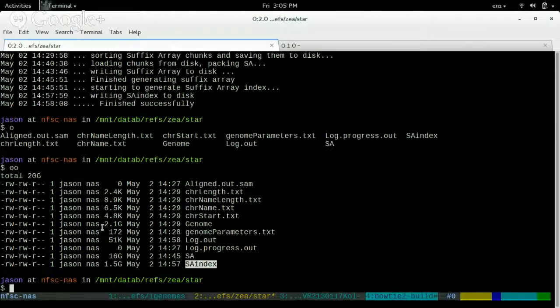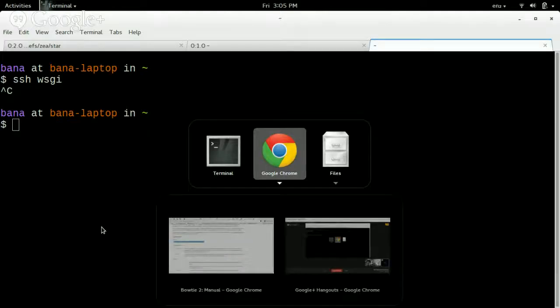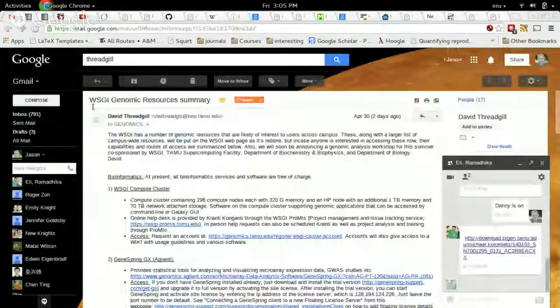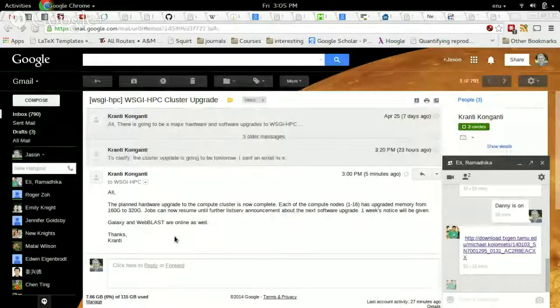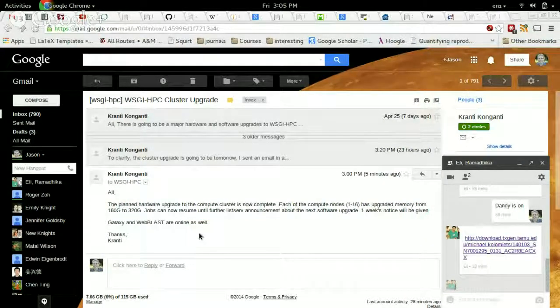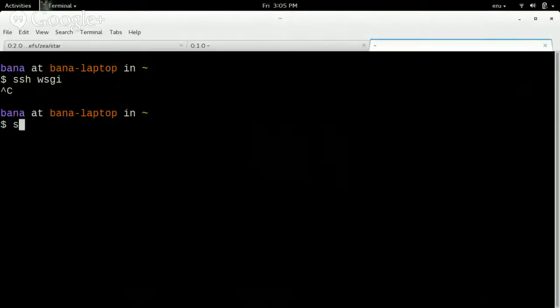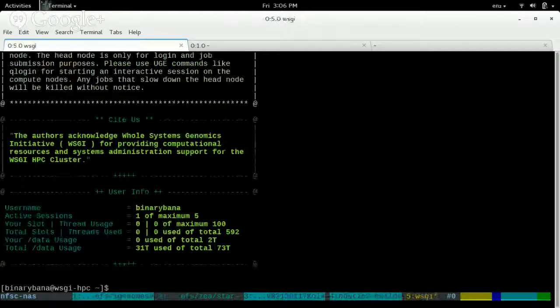Oh, and another thing, let me go ahead and show you. Let me log into WSGI. Oh, that's right, it's not going to work because he's upgrading it. Well, that was a good idea, but it's not going to work. Yeah, what was his email? I think he just said he's starting. Oh, no, he says it's done. Okay, that's good. So why can't I log in? Let me try doing it from here. Oh, okay, there we go.